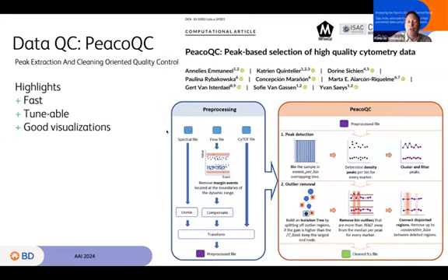However, if you're doing spectral cytometry, maybe you don't want to remove anything that is off the scale on any one of your detectors, because if you've got a lot of detectors, you're going to lose a lot of cells that just didn't have signal or were particularly bright on one detector and were, you know, completely legitimate data for the large majority of them and so forth. So I recommend not using the remove margin events, and I will show you the buttons in FlowJo to turn that on or off if you'd like.